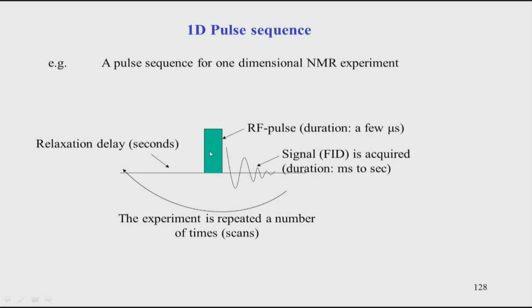Now, once you remove the pulse, the magnetization goes back towards the z axis and it dephases in the xy plane, and that is what we call T1 and T2 relaxation. During this time when it is in the xy direction, it starts dephasing. The dephasing is what is captured as a signal decay, which we can see here, and the oscillation, the magnetization rotating and going back to the z axis, comes from the chemical shift, and that is captured as the frequency of this wave.